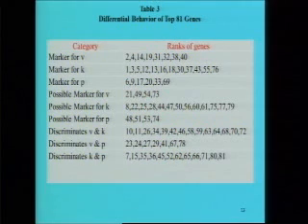So these rank 2, rank 4, rank 14, 19, 31, 32, 38 and 40 genes, whose annotation and identity can be obtained from our first data matrix, can be designated as markers for Vata prakruti individuals. The next group of genes, ranks 1, 3, 5, 12, 13 and so on, are marker genes for Kapha prakruti individuals. The next group, 6, 9, 17, 20, 33 and 69, whose identities can again be obtained from the data matrix, are the markers for Pitta prakruti individuals.